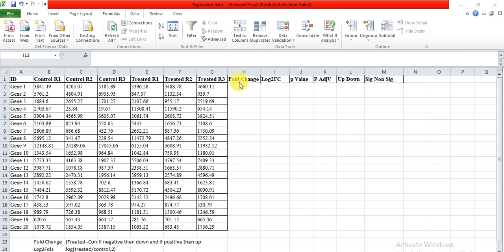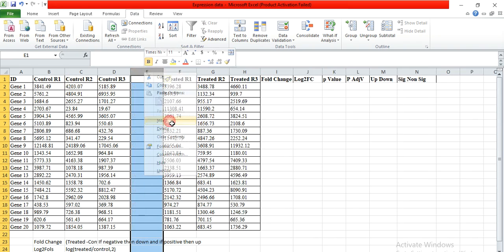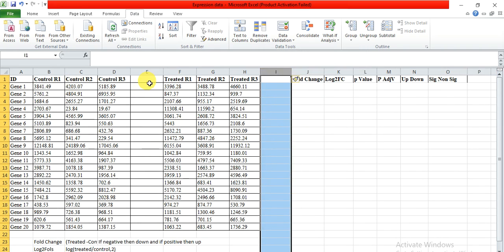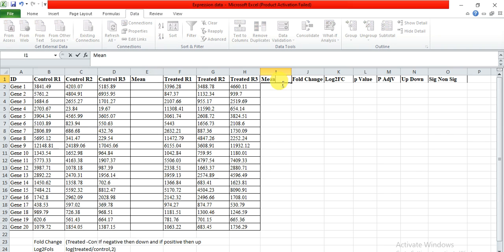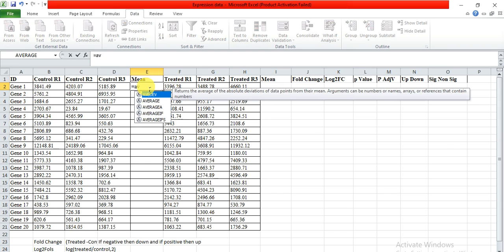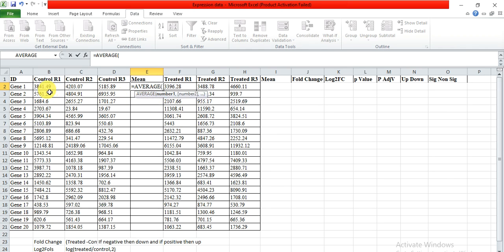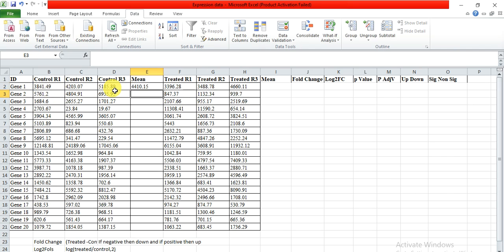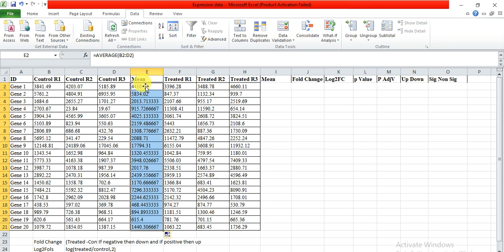First, we need to calculate the fold change. For calculating fold change, we need the mean value of our replicated data. So first we add a column here and then use the mean. The formula is: equals AVERAGE, then select these three replications and press enter. We have got the average or mean of these three replications. Then select this cell and at one corner when you see the black plus, drag it down. You will see the formula applied in all rows and you get the mean of all your replicates.